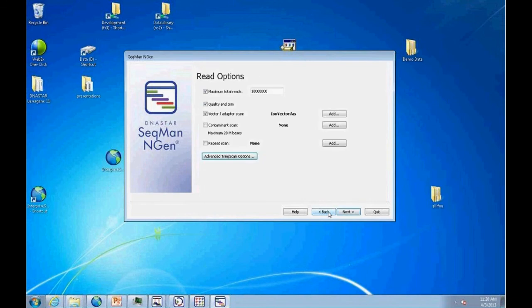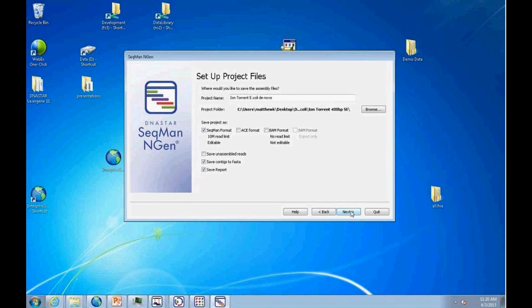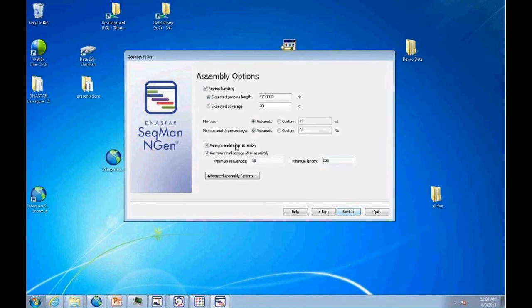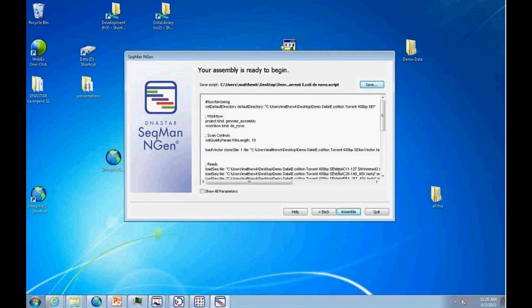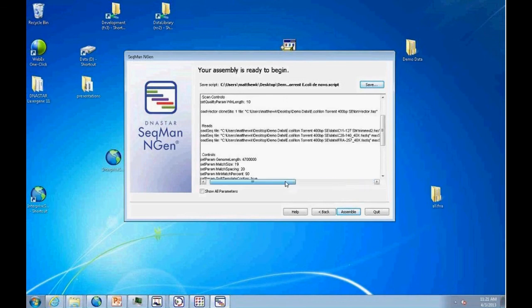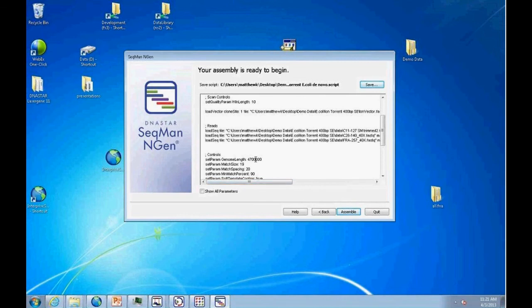With all options set, the wizard writes a script file saved to the output folder. This script file is useful for troubleshooting — DNA Star support can review it to diagnose issues like zipped input files. It also allows running the program from the command prompt, enabling advanced users to batch multiple scripts together and run 20 assemblies overnight for higher throughput.